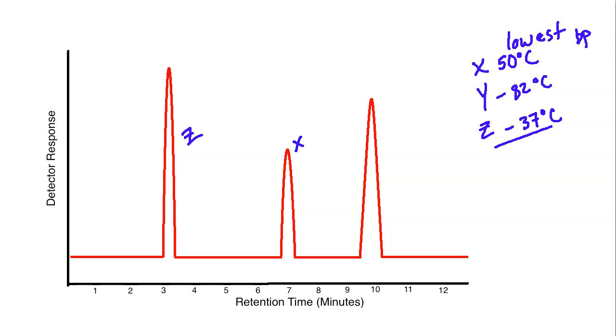So X would be associated with the peak that's right around the seven minute mark. And then finally, you would have 82, that's Y. And that would be this last one here that looks to be right around the 10 minute mark. So it's pretty simple to match up your compounds and directly relate them to the peaks to identify which peak is talking about which compound.